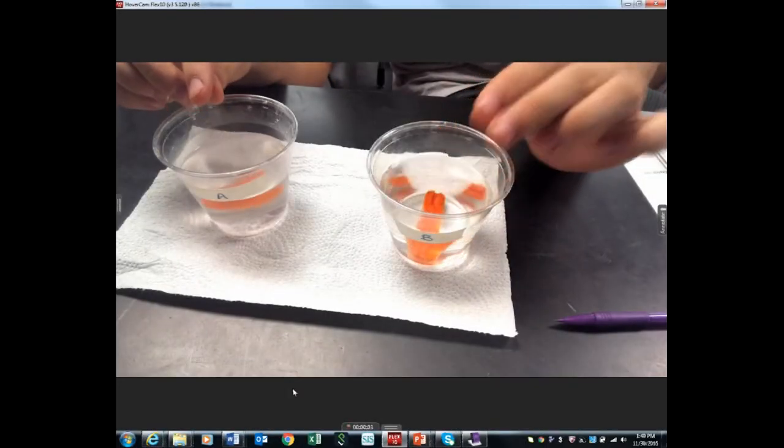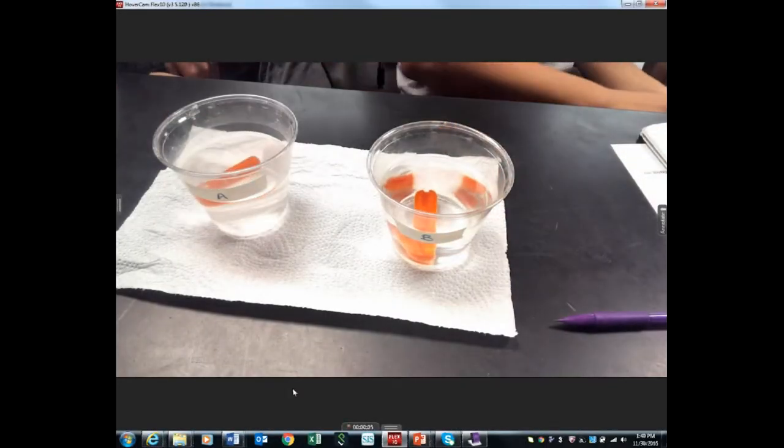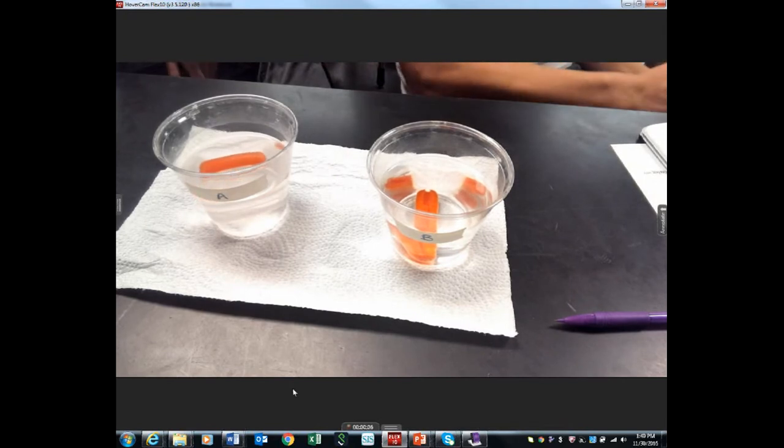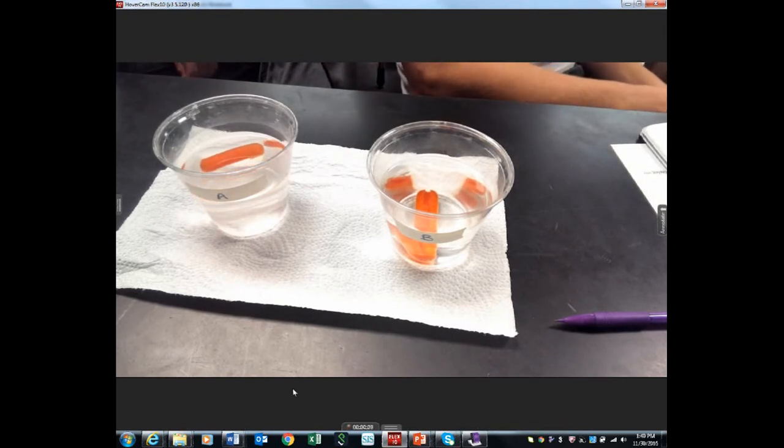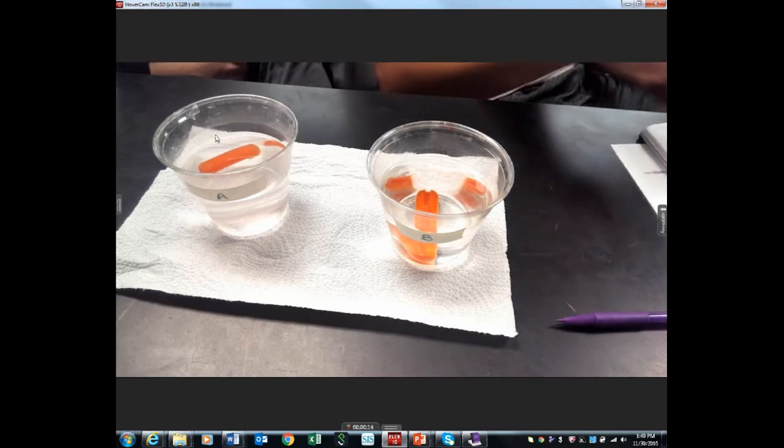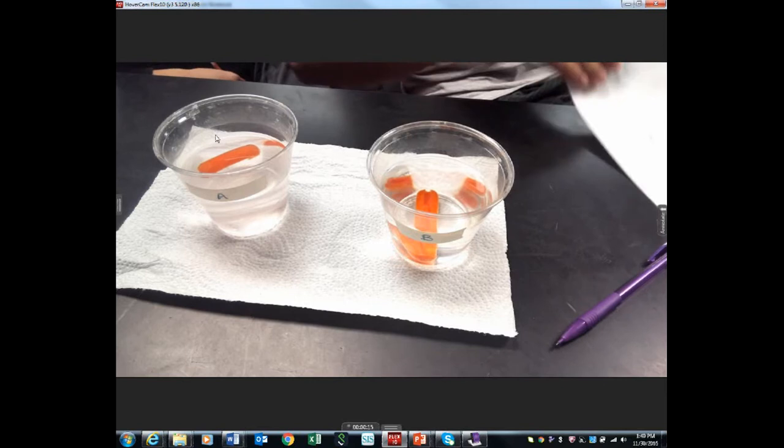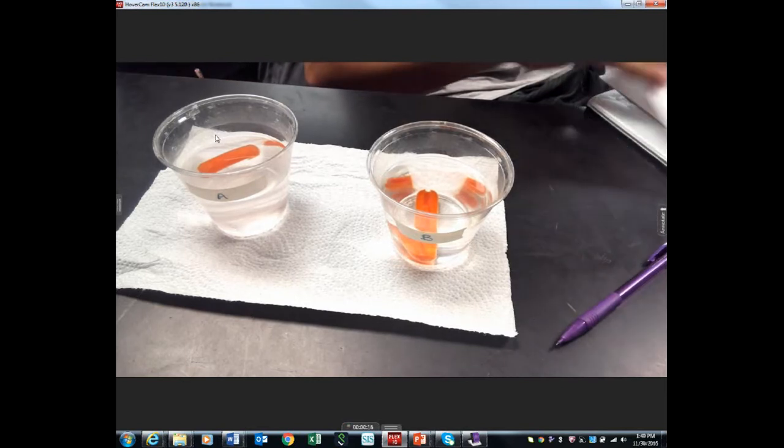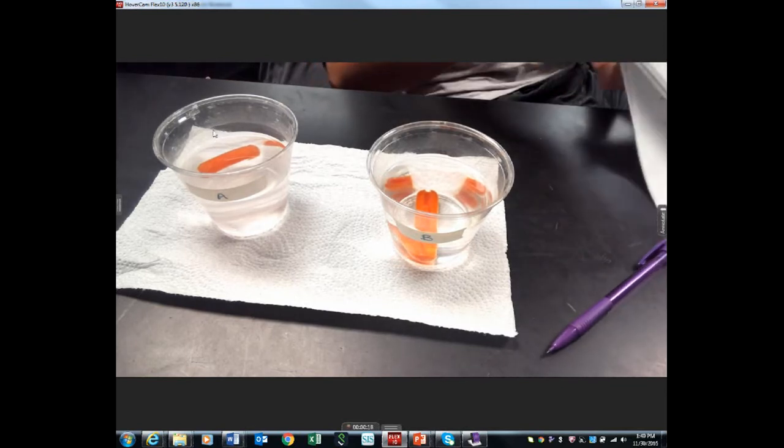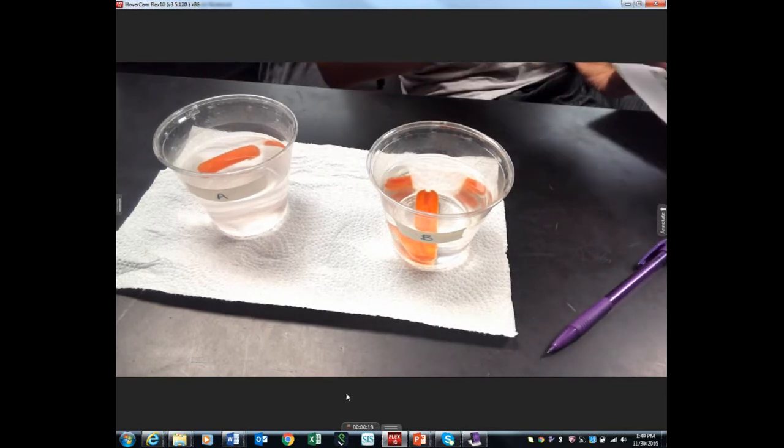You're placing your carrot in cup A and B. Do I drop it in? Hey look, that's an observation you can make. If yours floated and it's A, you can write that's one of your observations.